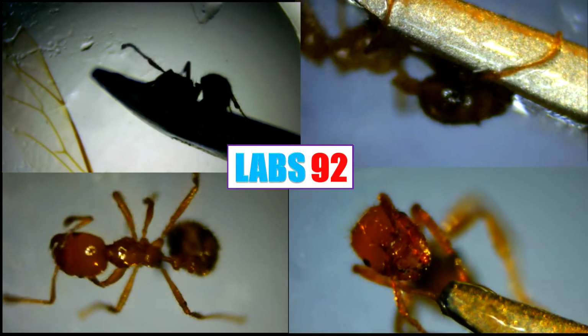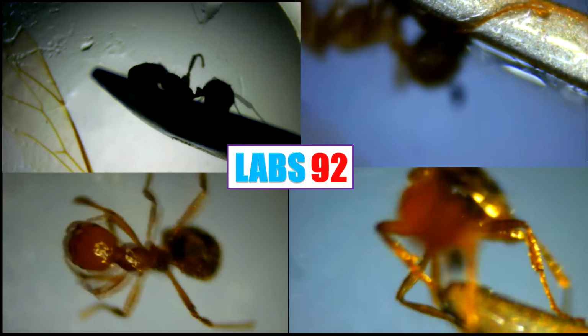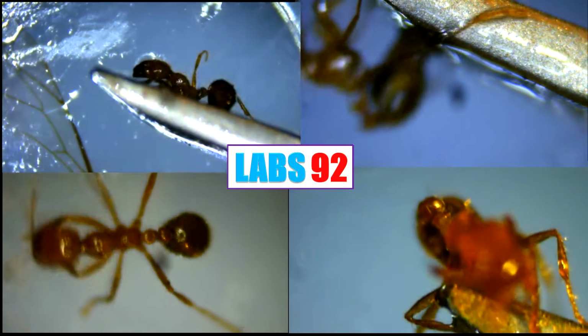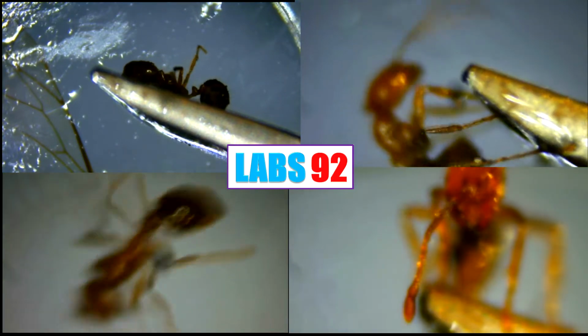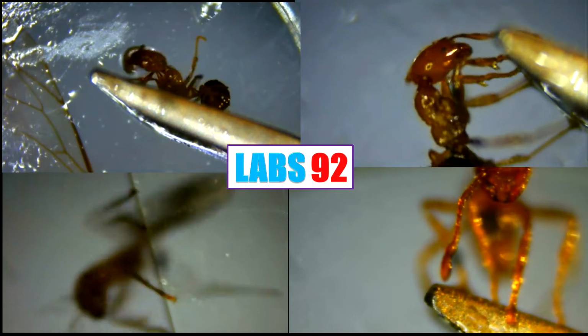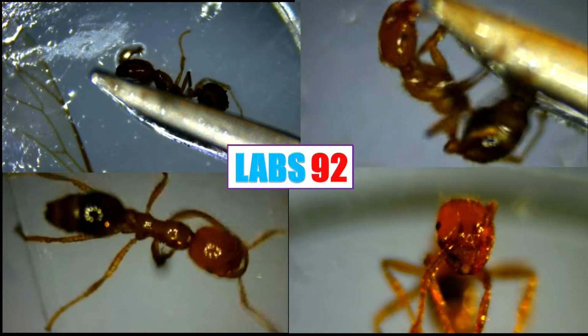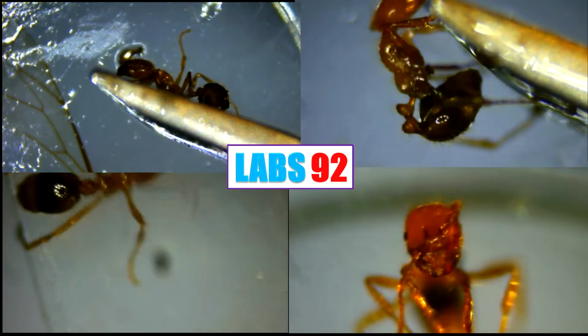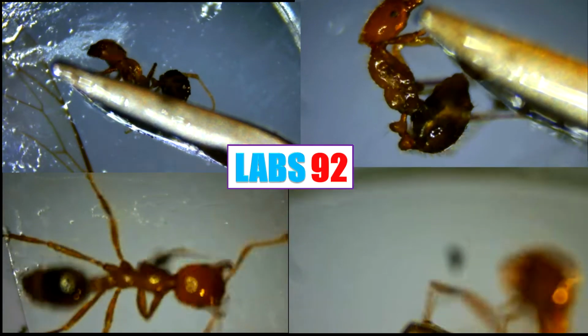I know that you are also curious about creatures in nature. Last time I made a video of an ant, but I think it was short and it did not have a good feel for you to watch. Today I am going to make a video with different perspectives. It will help you to see the ant better.